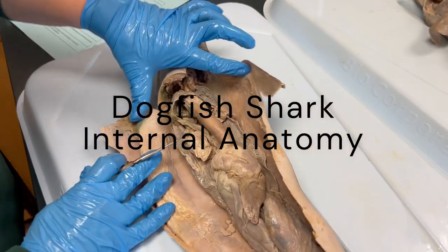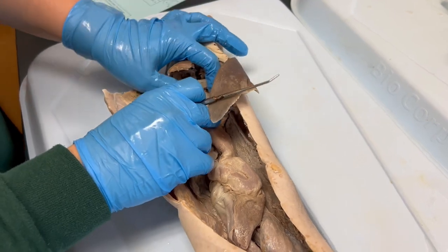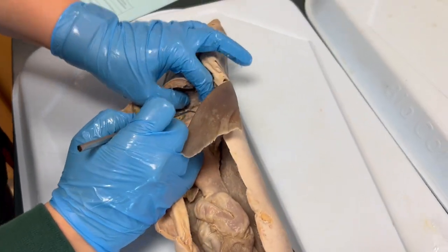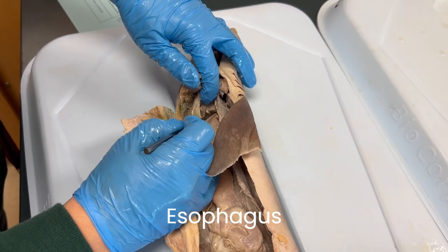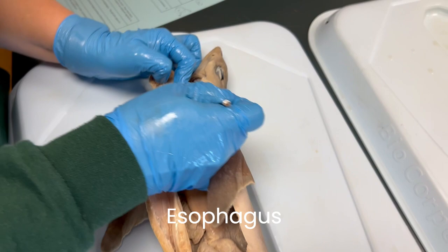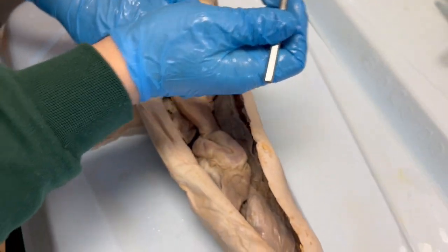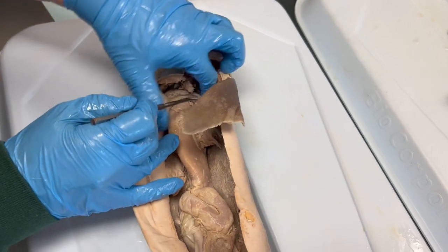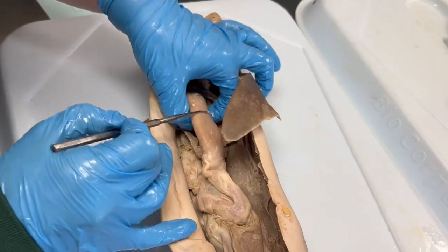Here is a review of some internal anatomy of a dogfish shark. I'm pulling the stomach a little bit more towards the caudal end of the shark in order to help identify the esophagus, which is here. It is the anterior most portion of the gut. Food enters the mouth, moves past the pharynx and into the esophagus, so the esophagus connects the mouth to the stomach.